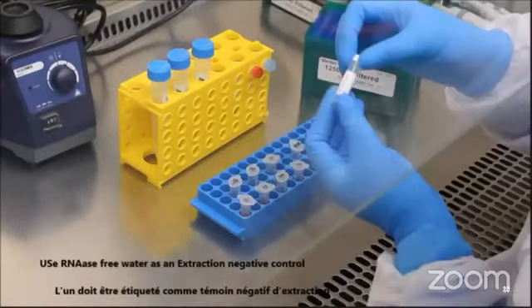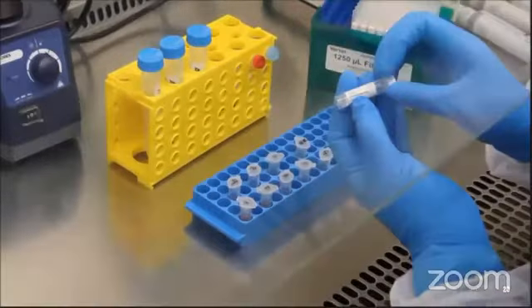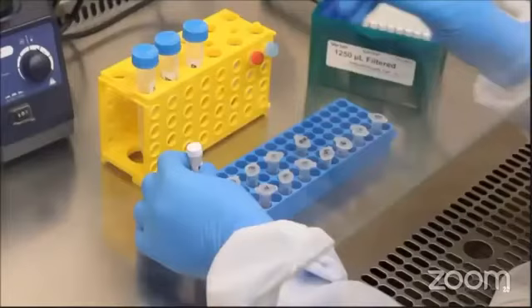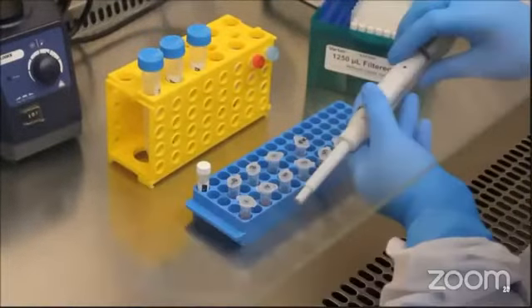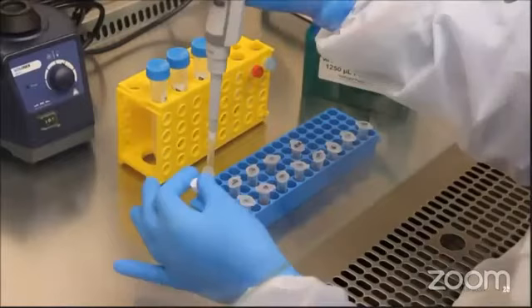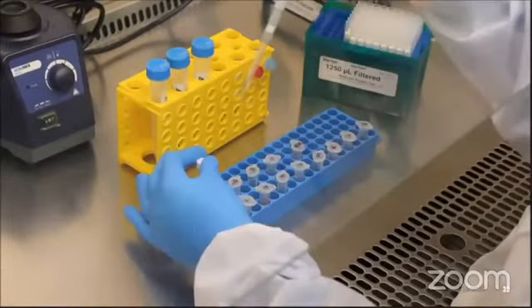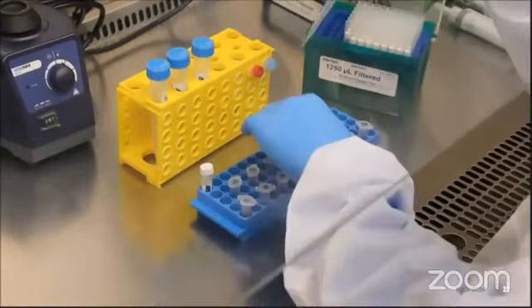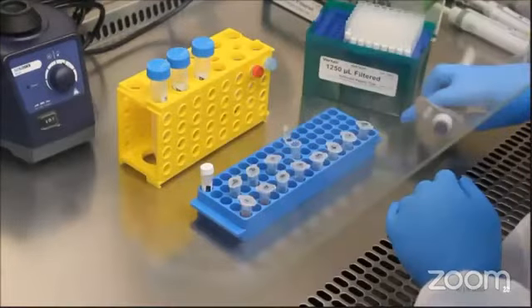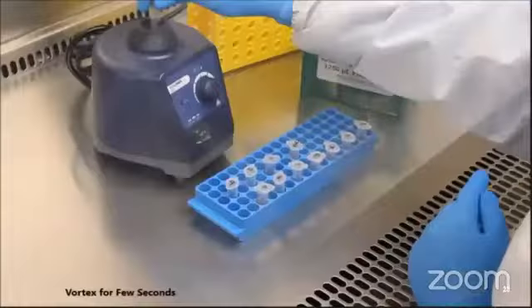Use RNase-free water as an extraction negative control. Negative control is very crucial during the extraction procedure. It is chiefly used to monitor contamination or cross-contamination. Treat the negative control as a sample by taking the same volume, 140 microliter.